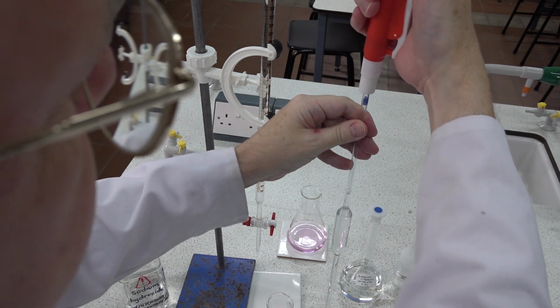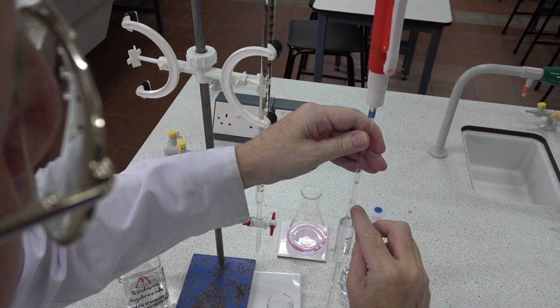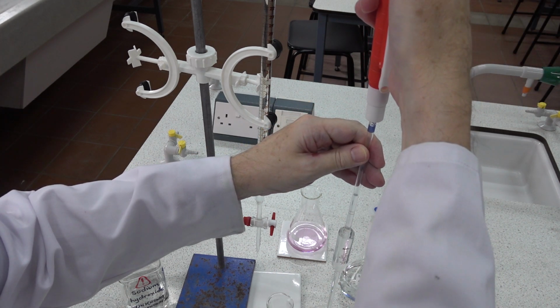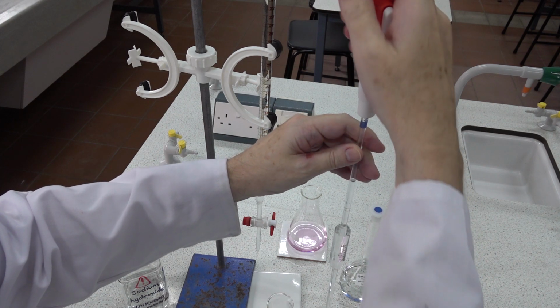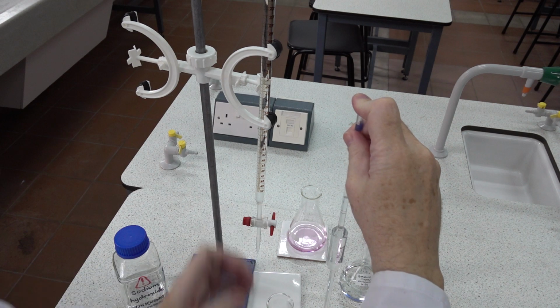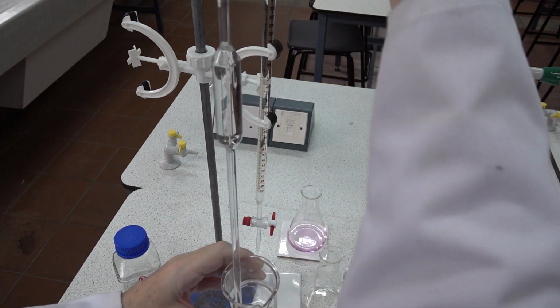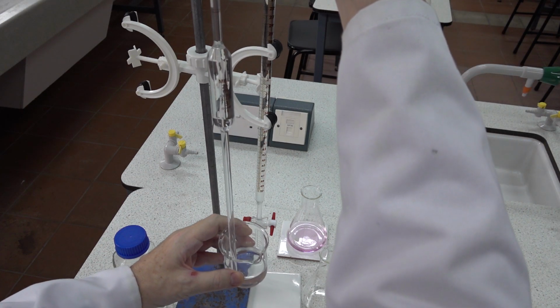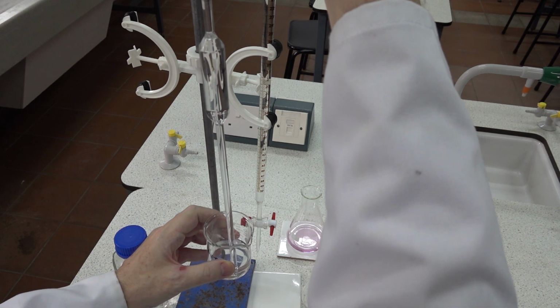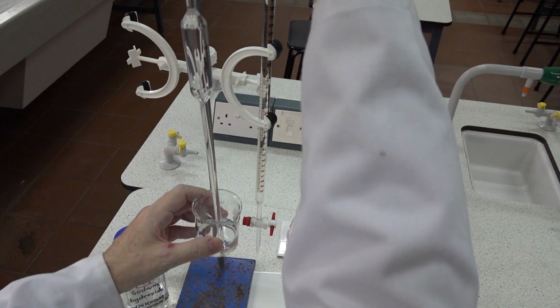Now, the facility to do that, of course, also means that you can use the pipette filler to lower the volume of liquid down to the meniscus here, but you've got much finer control with your fingers. So equally, if you just draw up to about here, you can put your finger on, swap your finger over as need be, and then use the fine control of your finger to lower the solution down. And if you overshoot, well, it's no big loss, no sort of hazard there. So we just go down slowly.